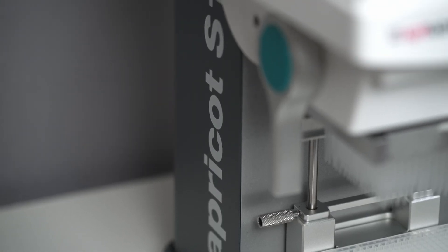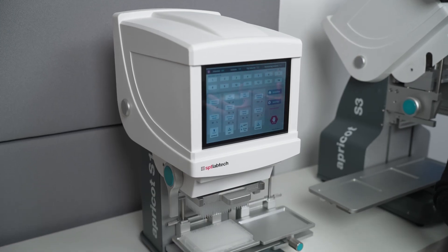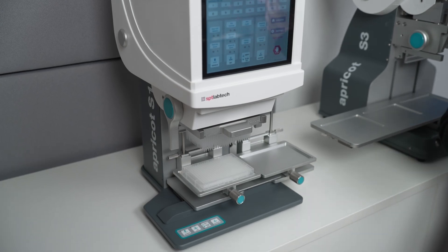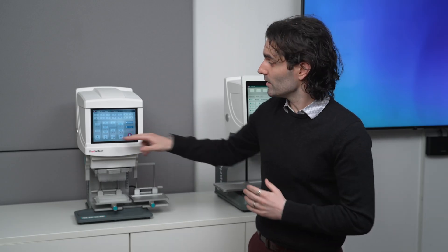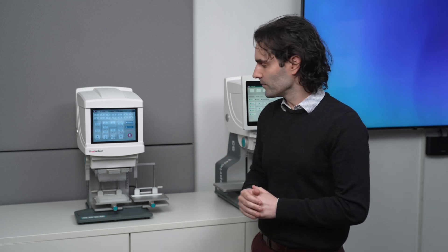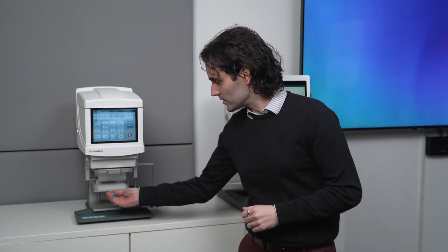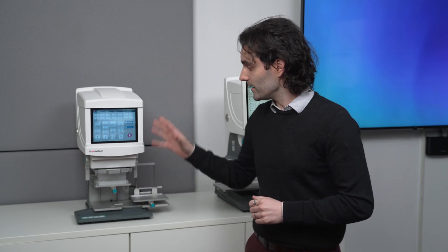Starting with the S1, just over here — the S1 is a semi-automated pipettor. The pipetting on the S1 is automated, so you control it through the software, through this nice touchscreen interface you can see here. But the movement of your deck, the movement of your plate, is manual. I can move my deck up into position and then lock it in when I'm happy, and then pipette into that plate using the software.